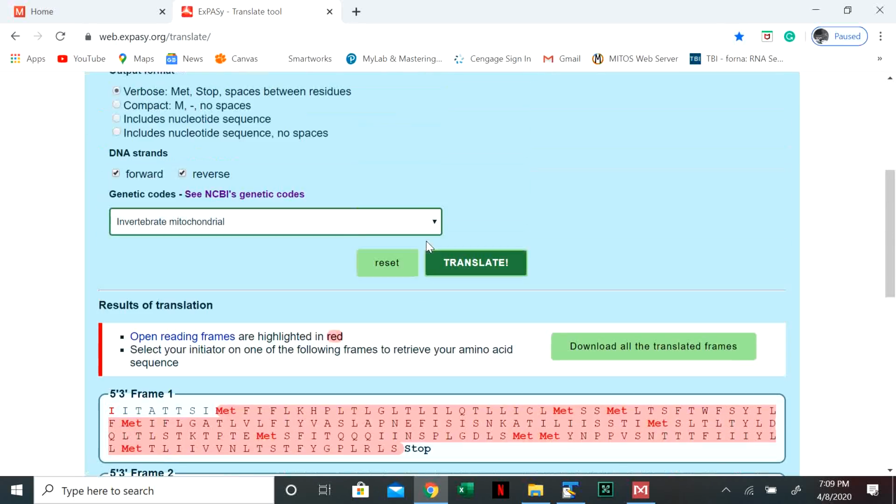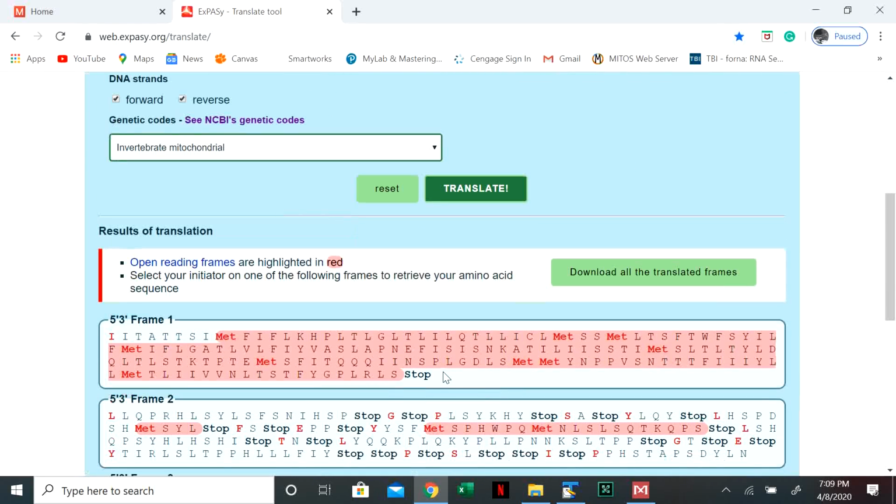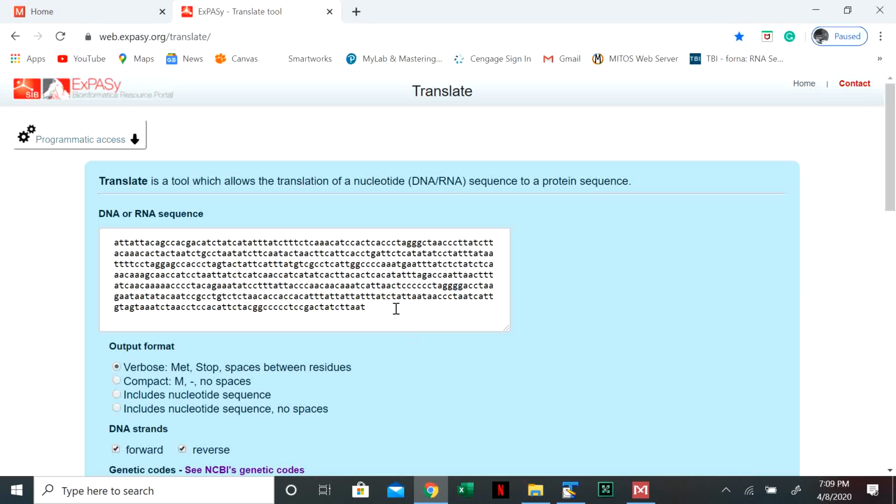And now we have a stop codon. Stop codons are either TAA, TAG, or TGA for the most basic genes. The other thing you need to be aware of: if I had an extra base here, like a T, it's going to read me as a stop codon, but it's not going to tell me there's an extra letter. So make sure that when you look to the end, the last 3 bases are going to be that stop codon.